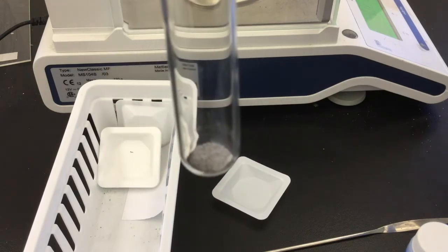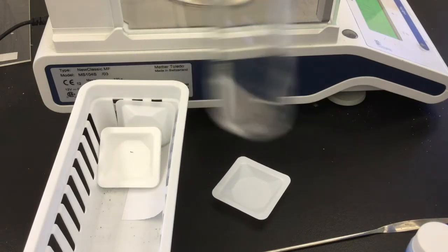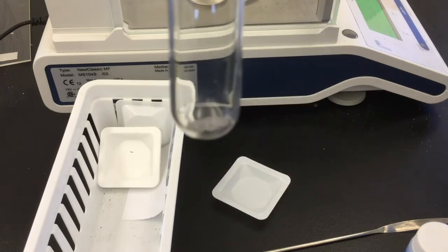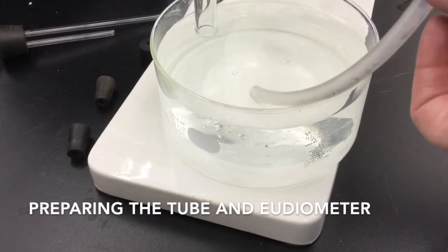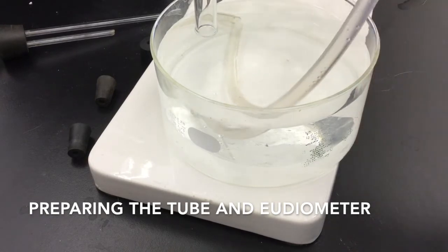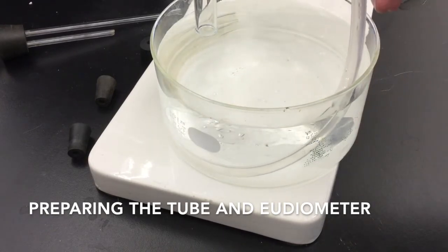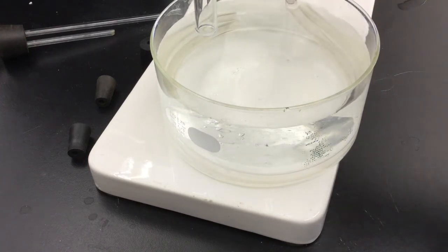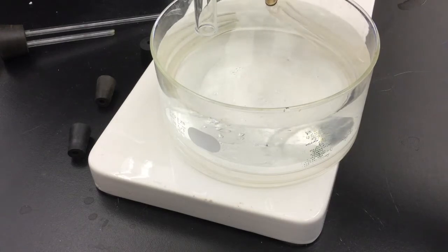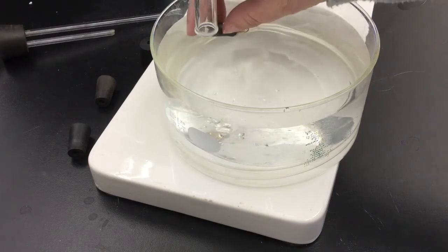You can shake your test tube so that the mixture looks gray and evenly distributed. Be sure to return the caps to the bottles before you leave the weighing area and clean up any mess you may have made, including disposing of your weigh boat. You need to fill your tube with water so that the heated air does not affect too much the calculation. Start by inserting the bottom of the tube and snaking the tube around until everything is underneath the water. If you just dump the whole thing under the water, you're apt to get air bubbles.